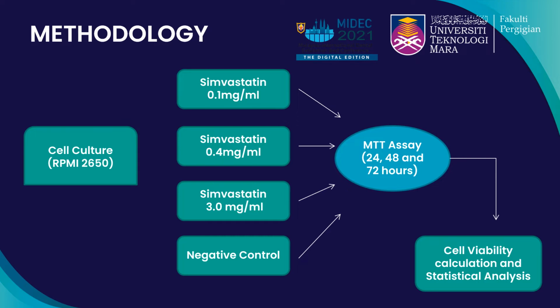Then, MTT assay was done for each simvastatin concentration and also negative control in 24, 48, and 72 hours accordingly. Lastly, cell viability calculation and statistical analysis was done for the result of this study.